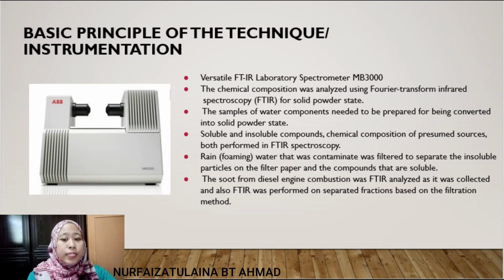The soot from diesel engine combustion was FTIR analyzed as it was collected, and FTIR was also performed on separated fractions based on the filtration method, meaning that the soot was mixed with water, left for 48 hours and then filtered, resulting in particles on the filter paper as a solid phase and a liquid phase that could contain soluble, miscible compounds with water, particles that form bonds with water such as H-bonds, van der Waals interactions, surfactants that also bind with the water through their hydrophilic region, and that are small enough to pass through the filter paper.